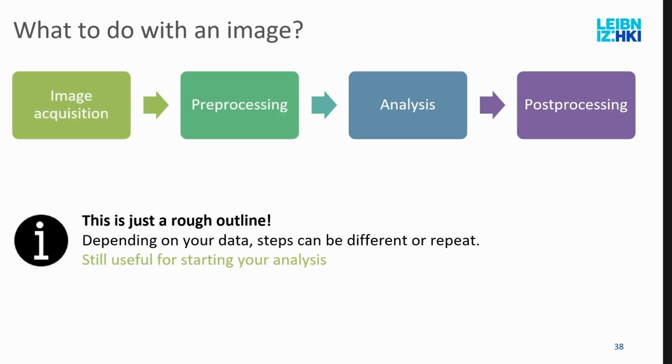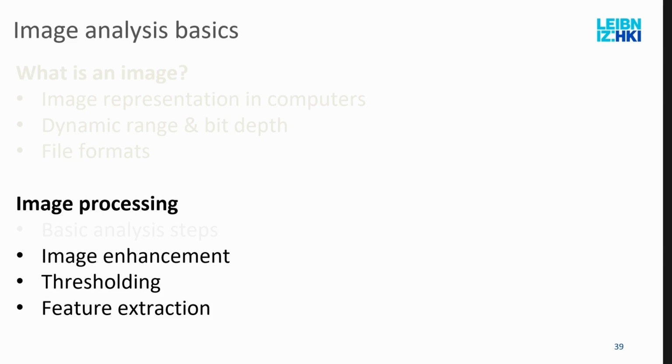And then sometimes you have post-processed data, and then, okay, I have this post-processing, this allows me to pre-filter something, so the analysis goes back. And then this general outline is often not so good. It's maybe a good start, but you will end up with analysis pipelines that usually don't look like that. They look very task-oriented to the data that you're working with.